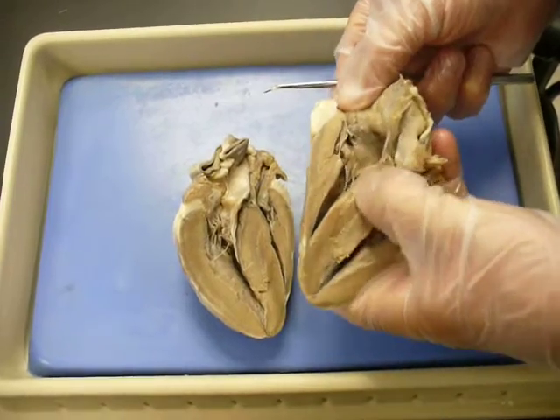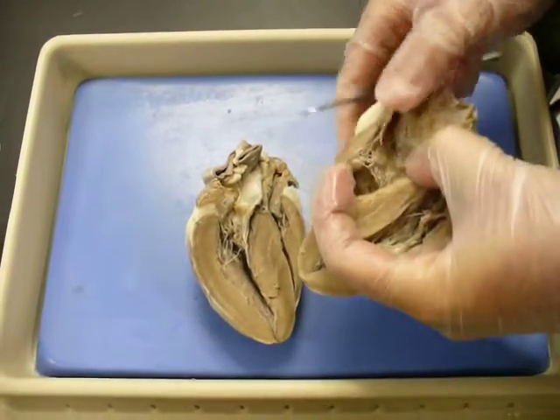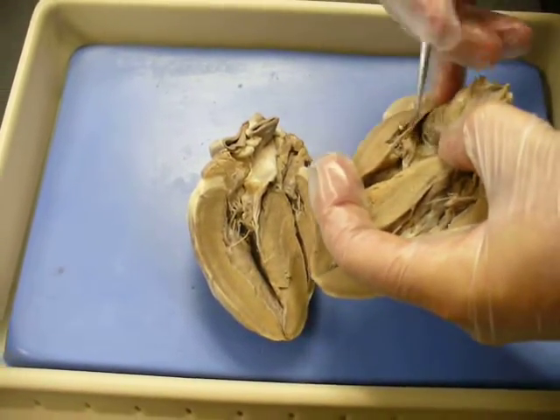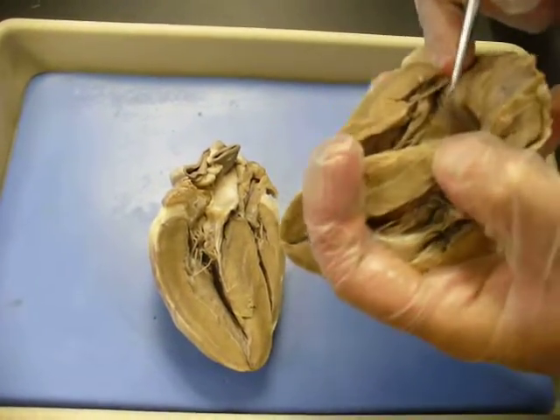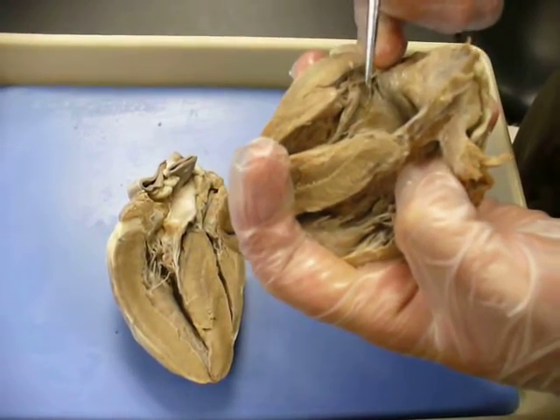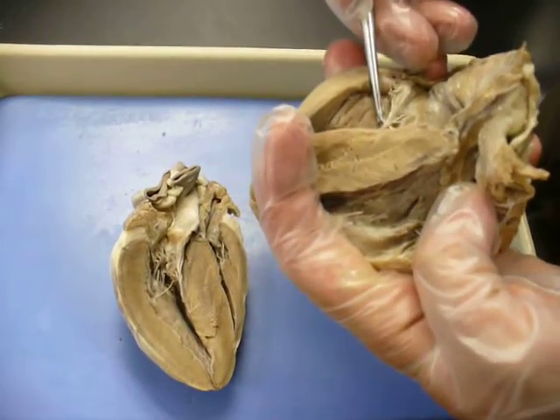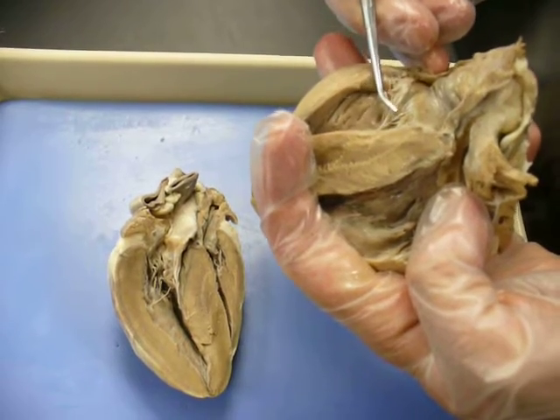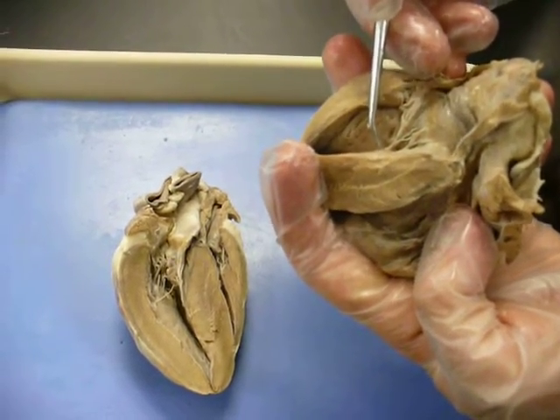This is all pectinate muscle. Blood flows down from the right atrium and it's going to go through your tricuspid — remember, tri. There's one of your cusps right there, another cusp right here, and that's your third cusp right there. So those are the three cusps. They're anchored by what are called chordae tendineae right there.